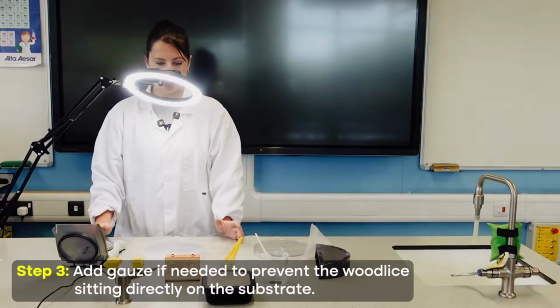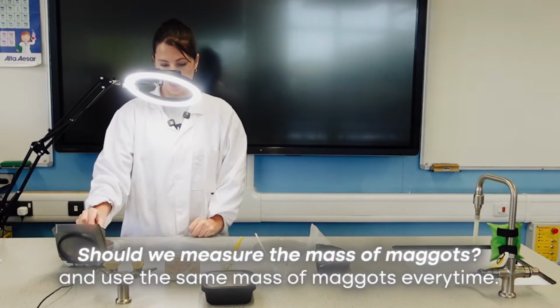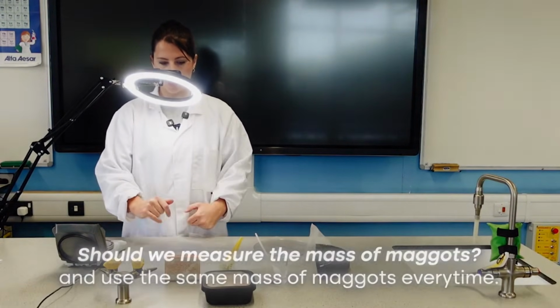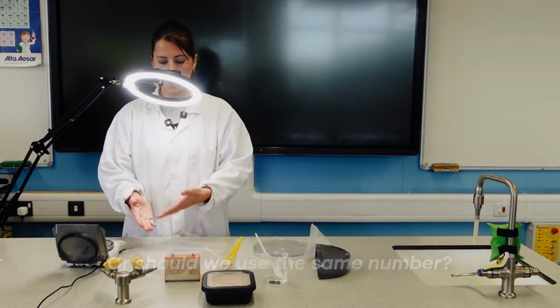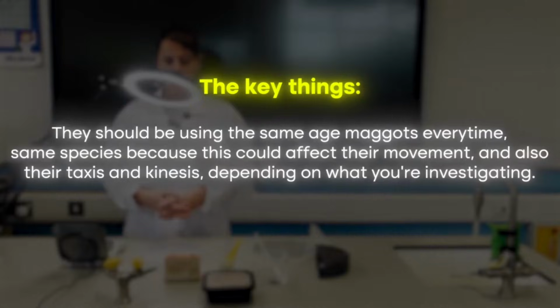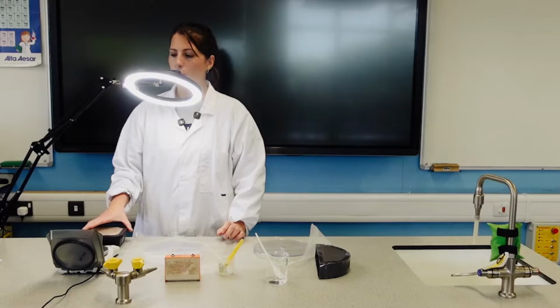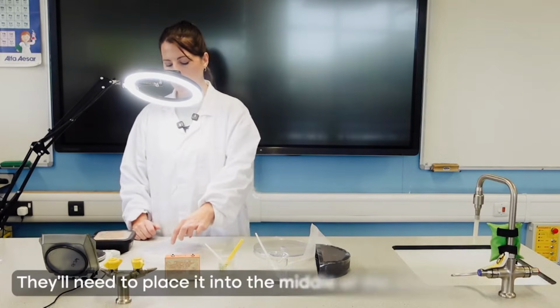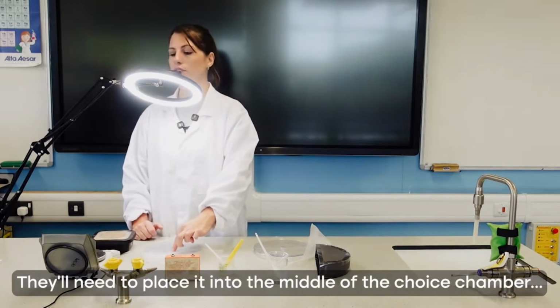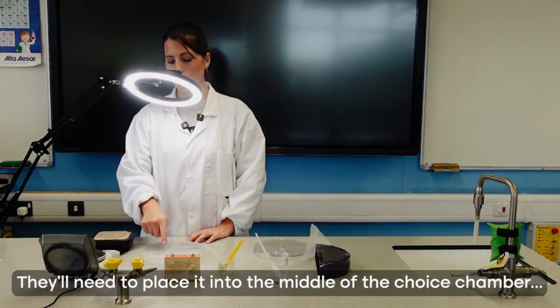So this is where you could get the students to consider for themselves which would be better. Should we measure the mass of maggots and use the same mass of maggots every time, or should we use the same number? It might depend on what you're actually investigating. The key things though is they should be using the same age maggots every time, same species, because these could affect their movement and also the taxis and kinesis depending on what you're investigating. When the students have measured it out as well, they'll need to place it into the middle of the choice chamber, and that's so they've all got the same start point, equal distance from all of the chambers.